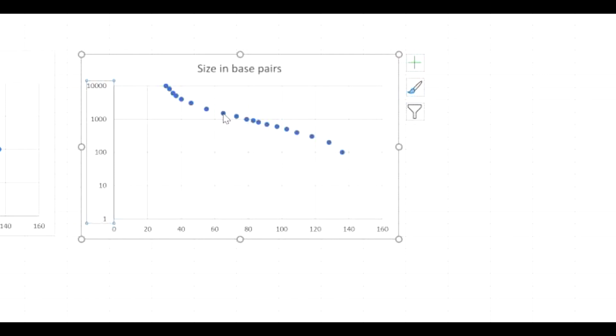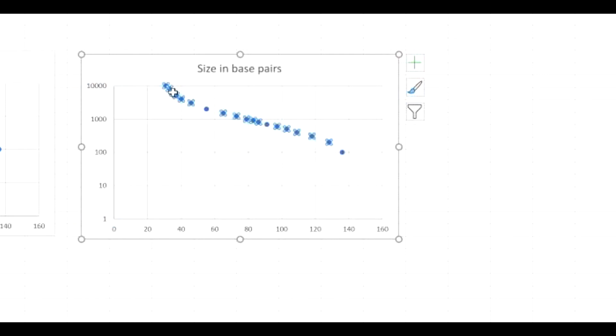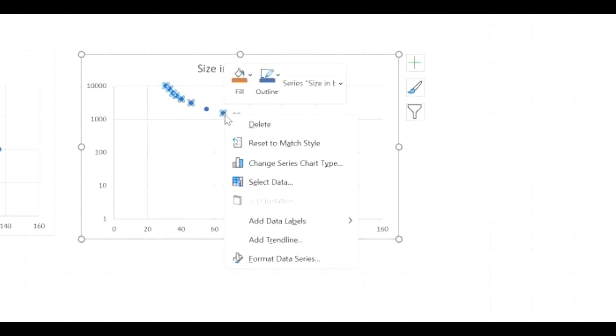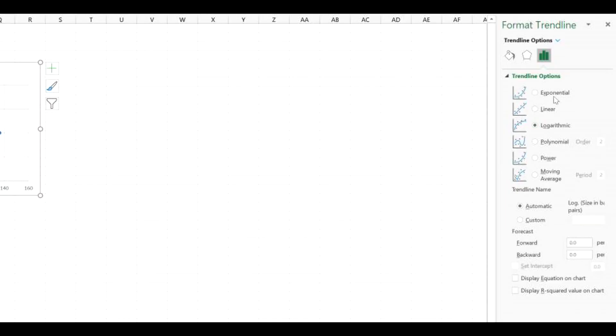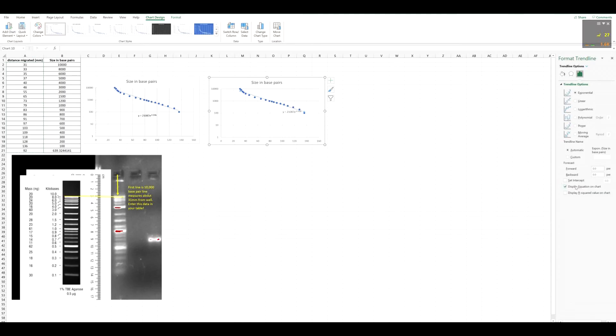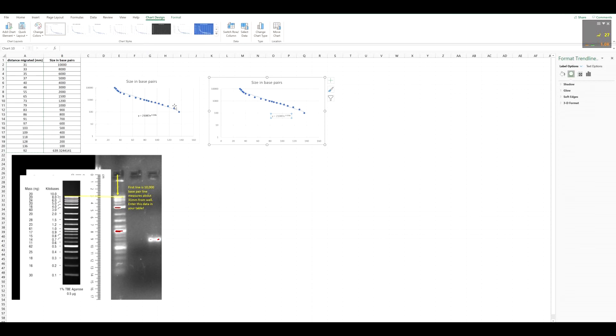Now the next thing you want to do is just click on any dot, and it should highlight all their data points. You just want to right-click on them, and then go to Add Trendline. And then this line will automatically appear. Click the exponential line, since this is an exponential increase. And then you want to display the equation on the chart. And this little equation should appear here. These two images are identical, so I'm just going to delete this one.